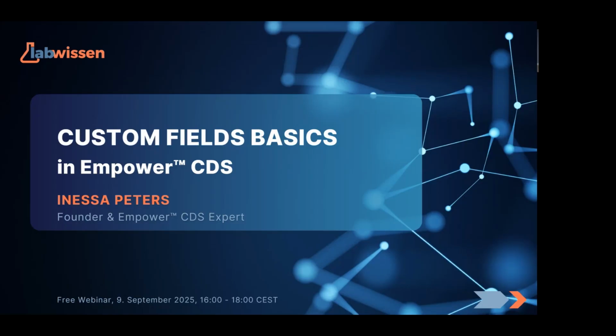I'm really excited to share my knowledge and experience about custom fields with you, and it's fantastic to see so many people interested in this topic. Trainings on custom fields are my favorite ones. They really make your brain work, and there are so many ways to use them. And it's always delightful to solve new challenges and automate calculations with custom fields. So I hope you share my passion about custom fields and want to learn about them.